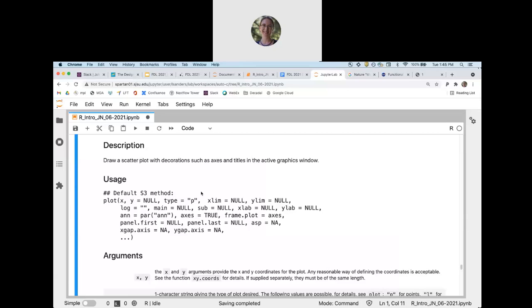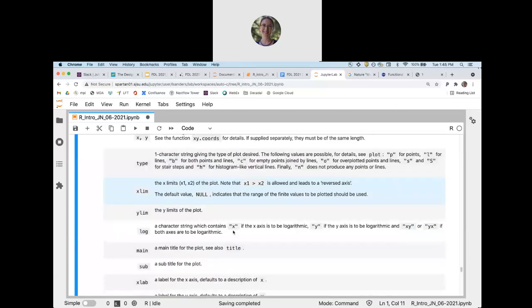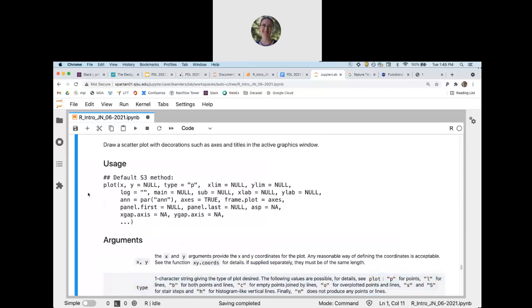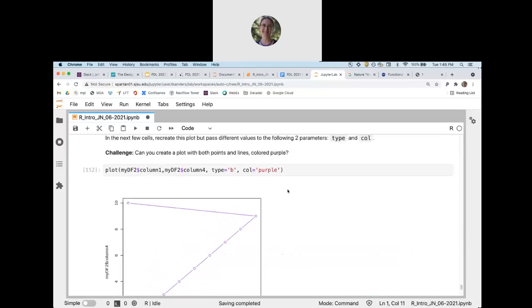So you need the sample names to stay the same across multiple data files. You don't want to rename the columns, but what we can do is set labels for the X and Y axis that are a lot prettier using the xlab and ylab arguments and passing those to the plot function.